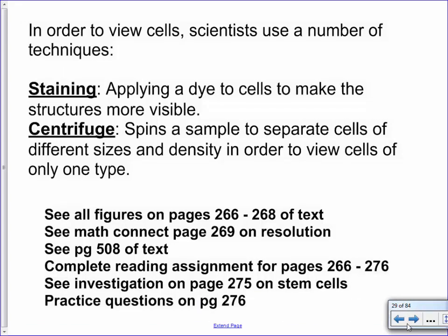Last slide, then we'll take a break here. I've already used the first word bolded, staining. Maybe you want to add this to your notes. We're going to use a chemical called methylene blue. It probably spells like it sounds. Methyl is M-E-T-H-Y-L. And then add an "ene" at the end, so E-N-E. It's methylene, and then blue.